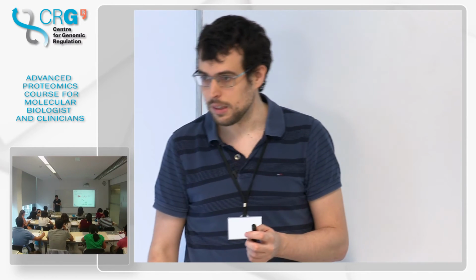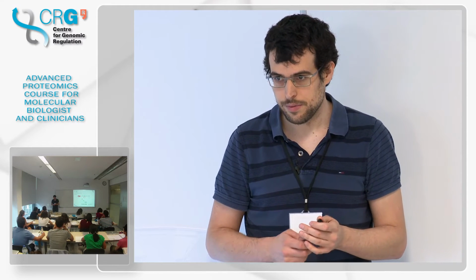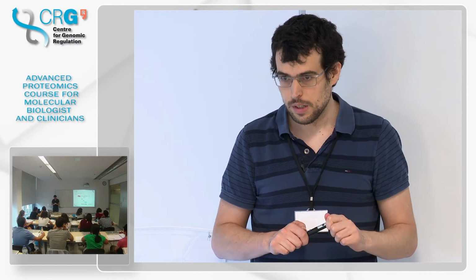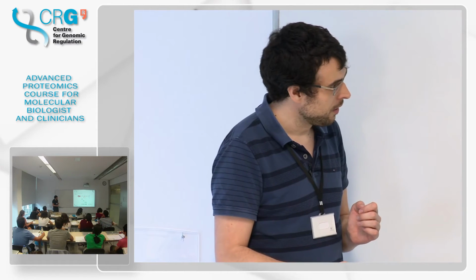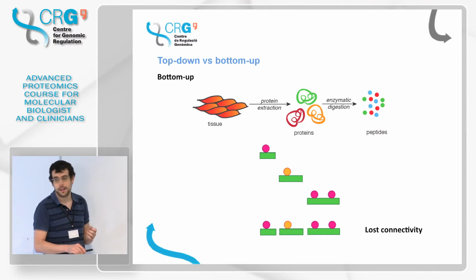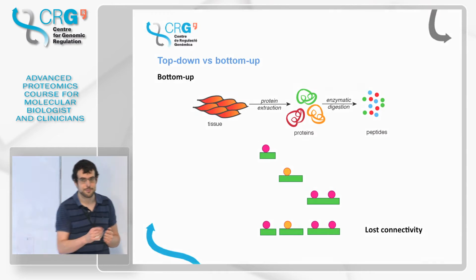You can maybe cut differently, because you always get the same pieces of the protein, since you use the same enzyme. Exactly. We could do other approaches, like changing the enzyme, to try to recover connectivity. For example, here I got these together. I could use another digestion enzyme to try to get these two together. This is a good approach to actually recover connectivity.